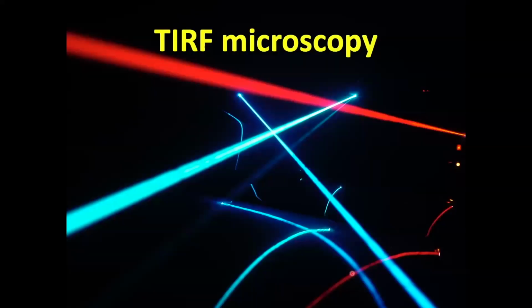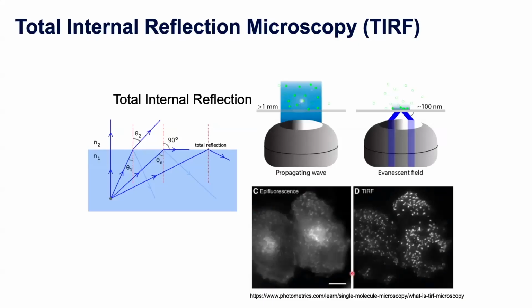So TIRF microscopy, which is also known as total internal reflection microscopy. For standard widefield or confocal imaging, this example shows widefield. We're illuminating our entire field of view, our entire volume, with the entire light coming from the entire objective. In TIRF microscopy, what we do is collimate the beam so it's a bit tighter, and we can translate it across to one side of the objective. What that allows us to do is to change the angle that that light comes out of the objective.